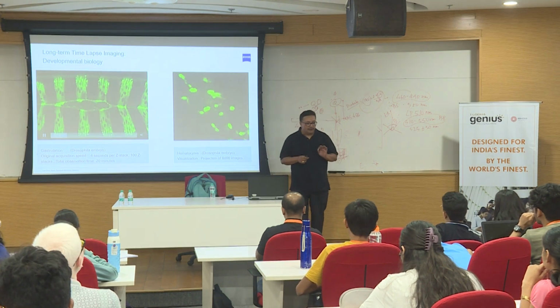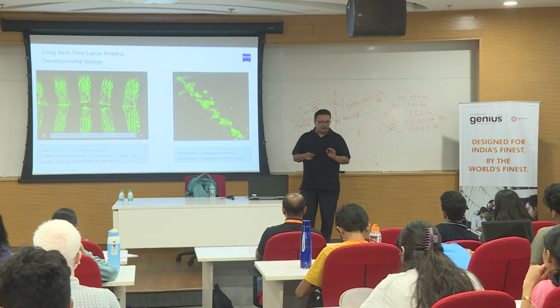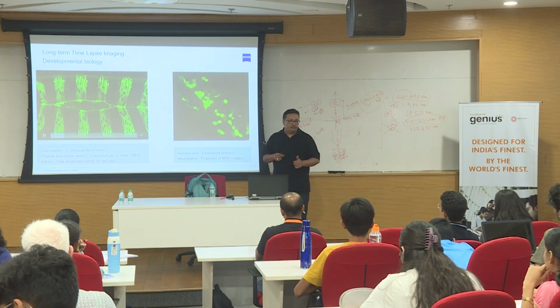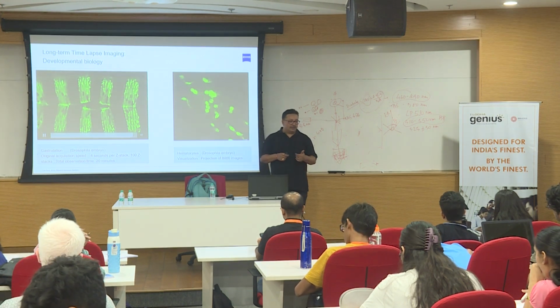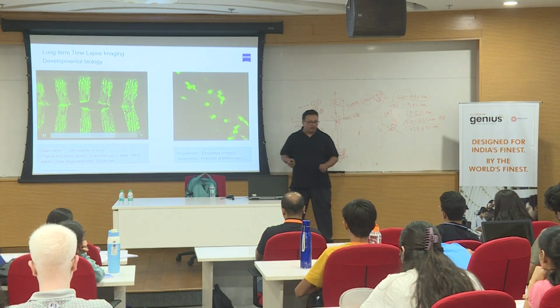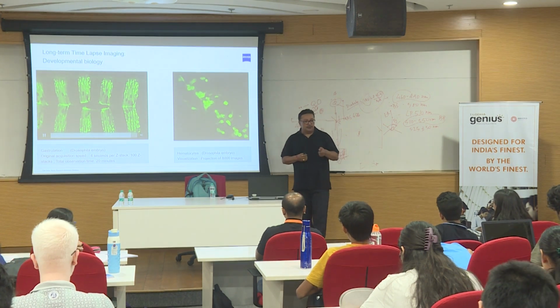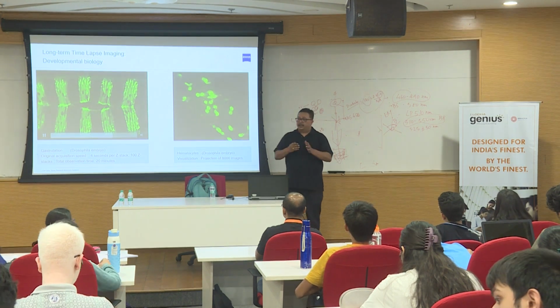You understand what is bleaching? Fading of the fluorescence, because the illumination can be at a slightly higher power and that will induce photobleaching and phototoxicity. And when it comes to live samples, photobleaching and phototoxicity are much more profound as compared to fixed samples, because you have the concept of adding some anti-fade and no anti-fade with respect to live samples. Live samples, you work with proteins, GFP or variants of GFP. Fixed samples, you can work with any of the organic dyes where you can use some anti-fades. But these anti-fades can only work with fixed samples, they cannot work with live samples.